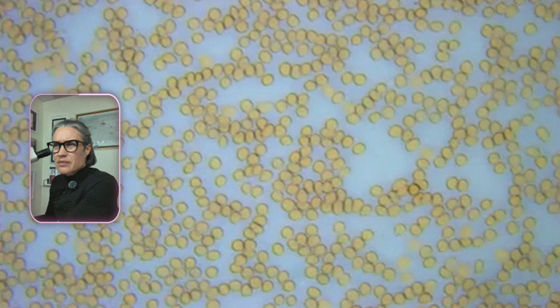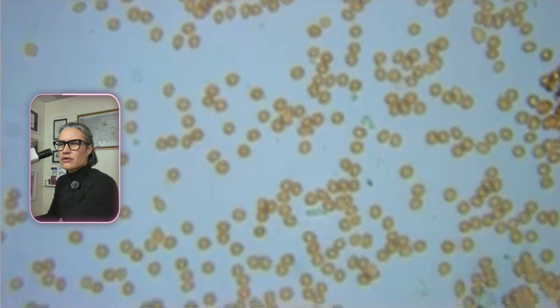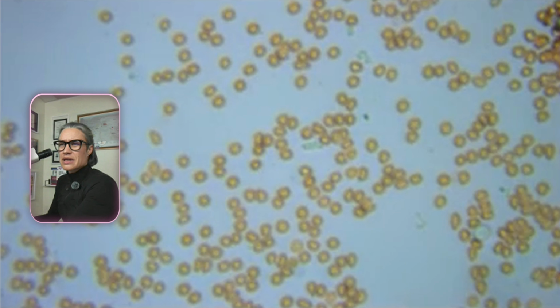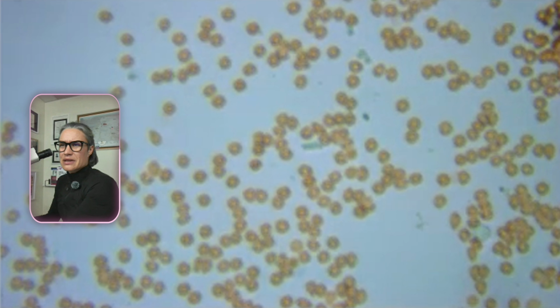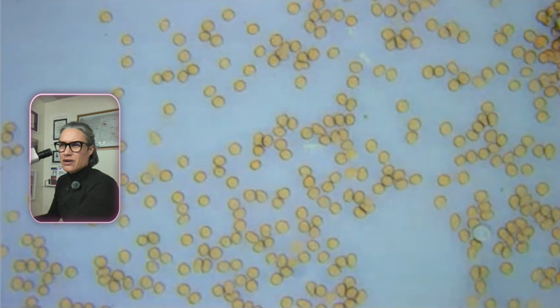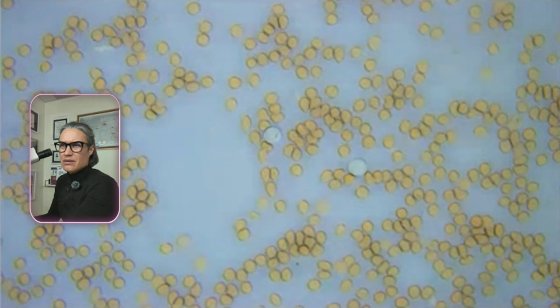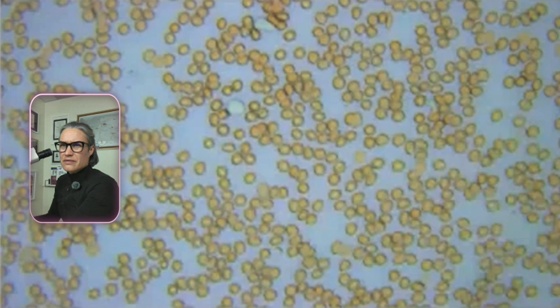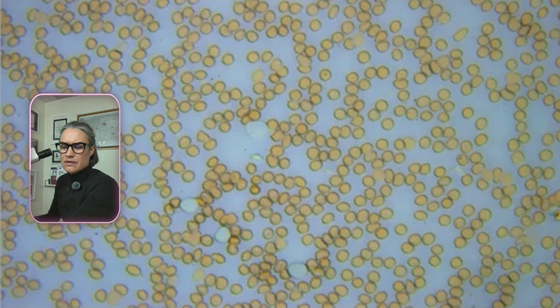But if we see more of them, then maybe that's an indicator that that's them. And you can see, when you play with the micrometer screw on the microscope, that the red blood cells are going to have this thinning in the middle, so they are actually concave discs. And here are some round cells where we don't see the nucleus very well, but they might as well be lymphocytes. Ooh, several of them.